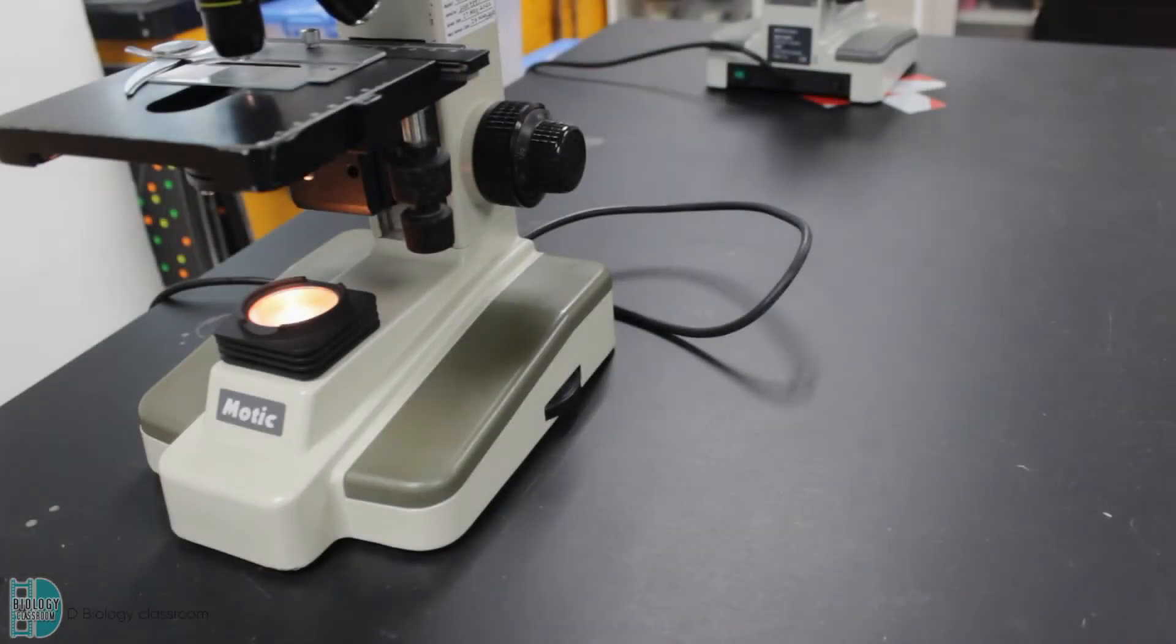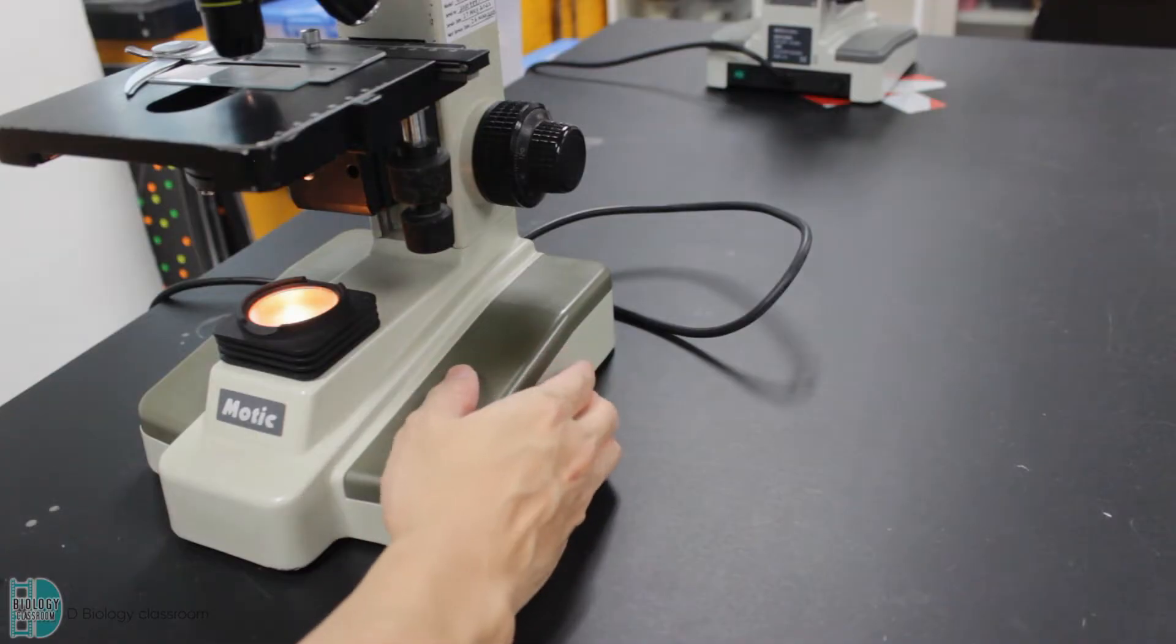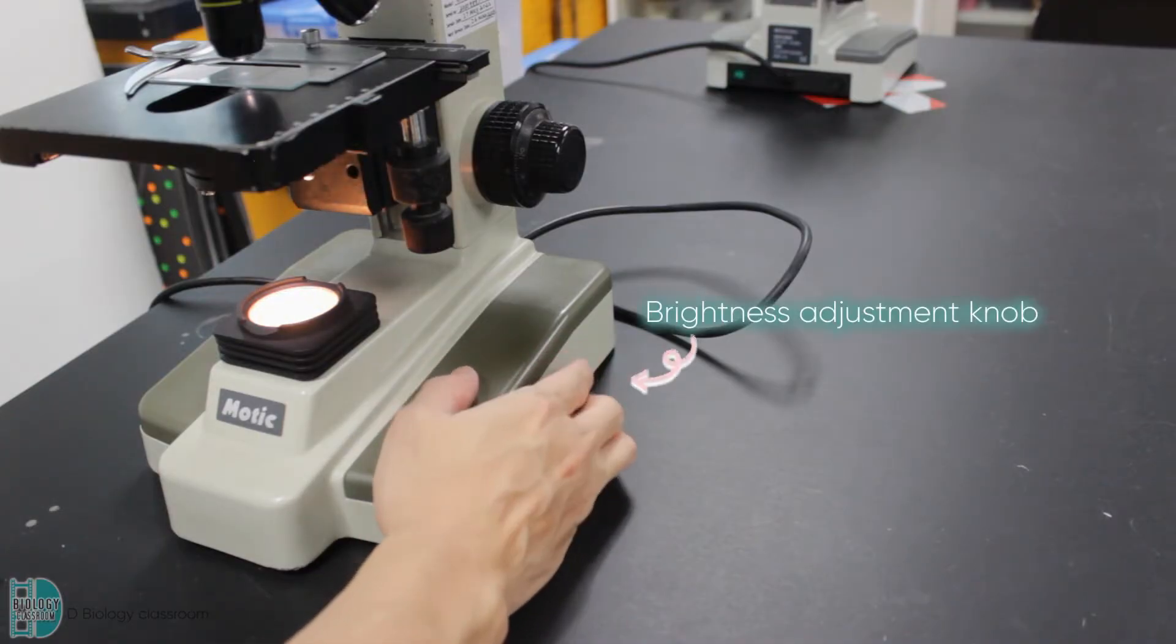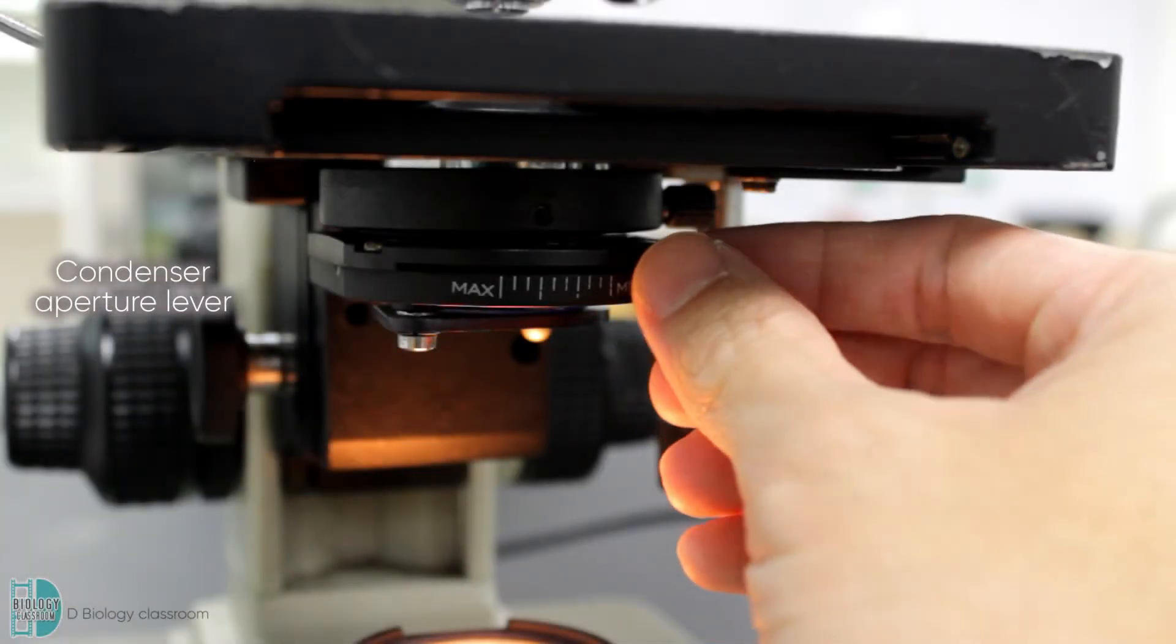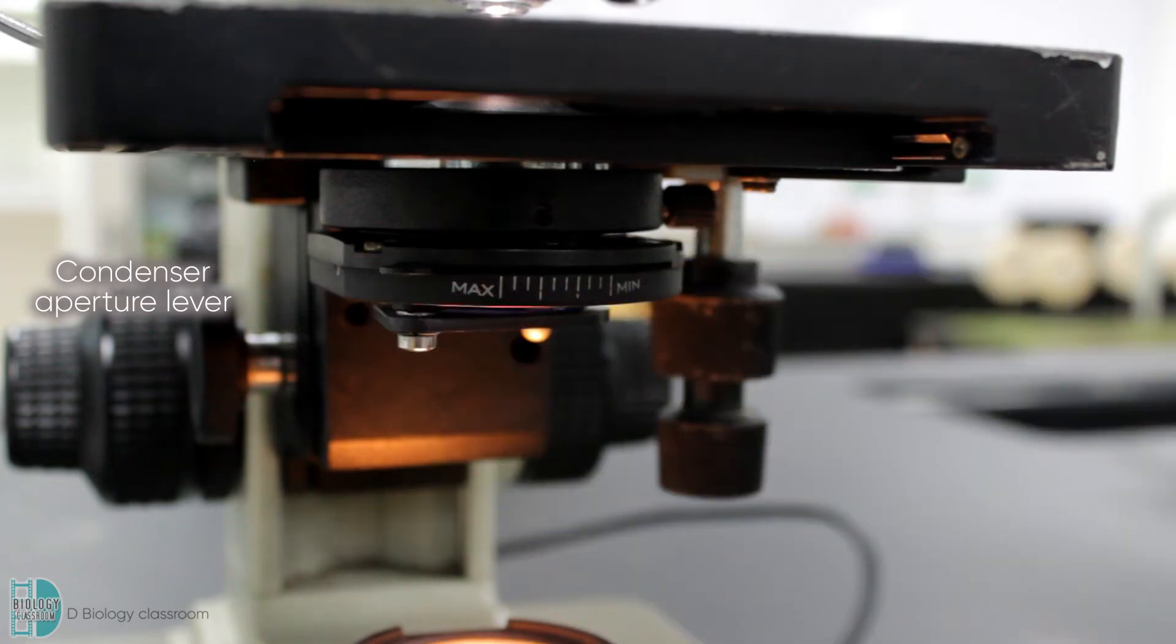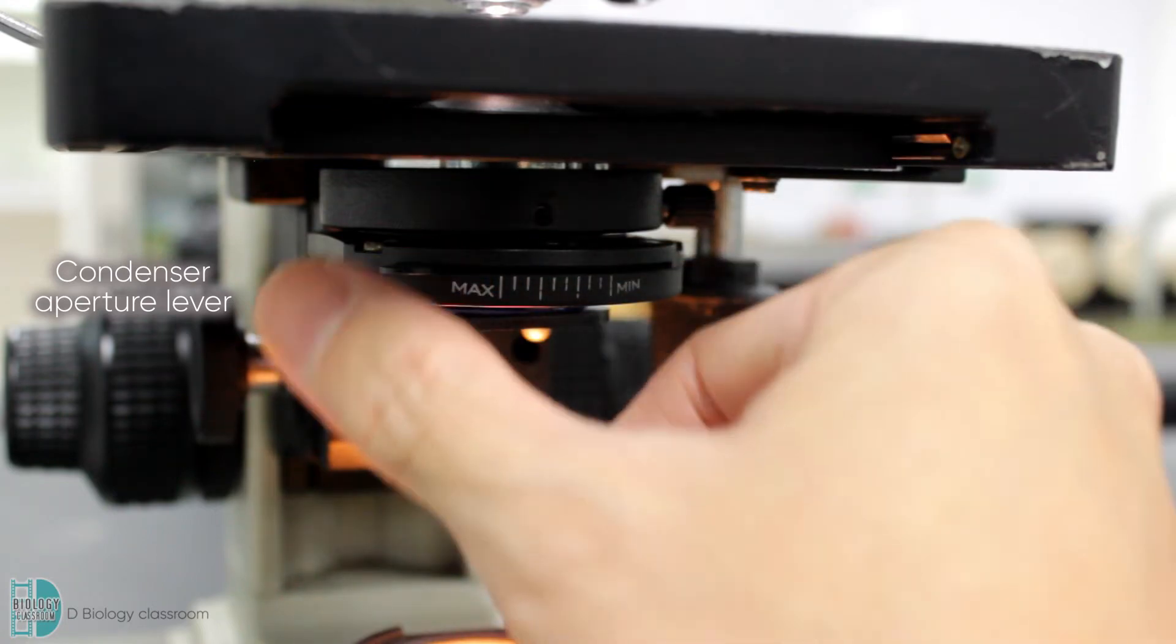If you are not happy with the brightness, there are two ways to adjust the light. Firstly, you can use the brightness adjustment knob near the base to control the level of illumination. You can also use the condenser aperture lever below the stage to allow different amounts of light to pass through the specimen.